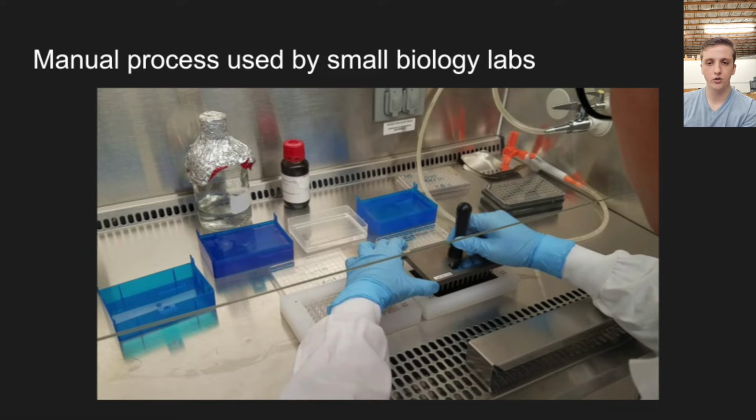The next thing you could do is get a liquid handling conversion kit. A liquid handling conversion kit goes on a liquid handling robot. These are robots that have pipetters attached to them, and they're generally used just for moving liquid from one reservoir to the other, but larger amounts of liquid. So you can take the pipette head off and put a robotic pin tool on it, and there are companies that sell this adaptation, and they can cost at a minimum around $10,000. So they're still pretty expensive, and they have their own limitations.